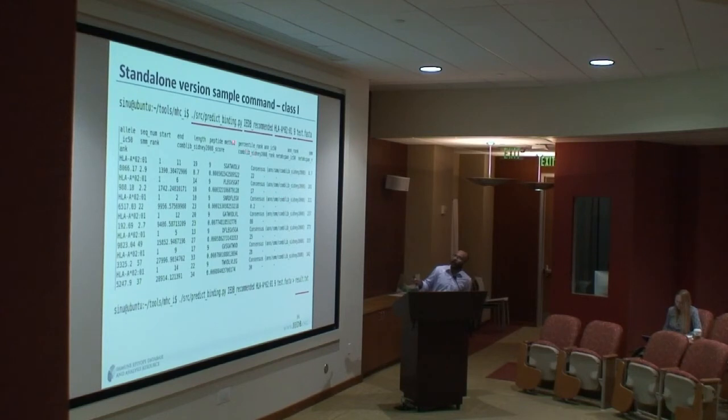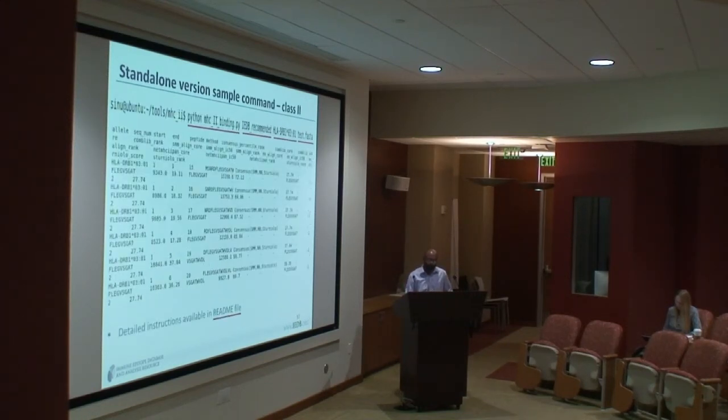So this is a sample command for class 1. This is the script or the tool, and then you select the method, allele, length, and your input file, and you'll get the results like this. You can store this as an output file by providing an output file name.